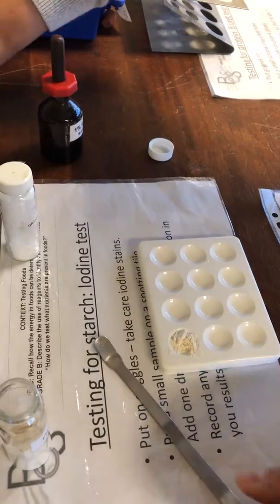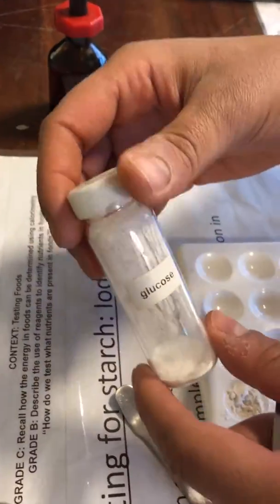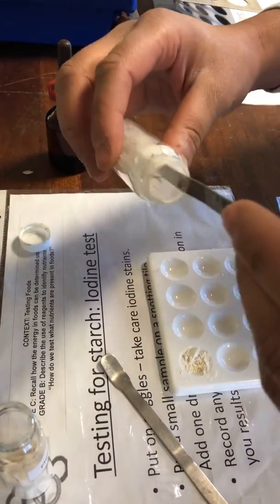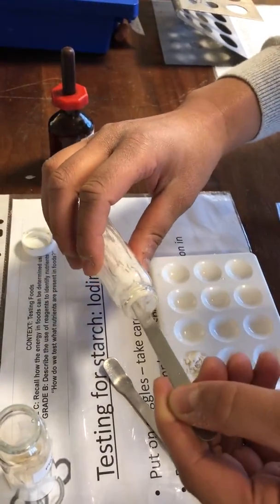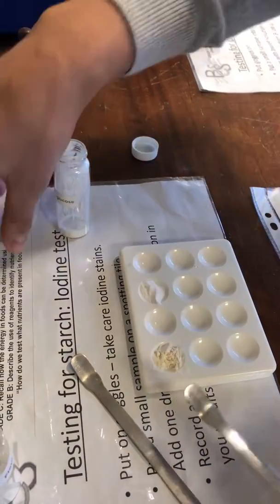Ideally get a new one. And we're also going to test for glucose, which should hopefully give me a negative result for starch. And I'll put that in the spotting tile there.